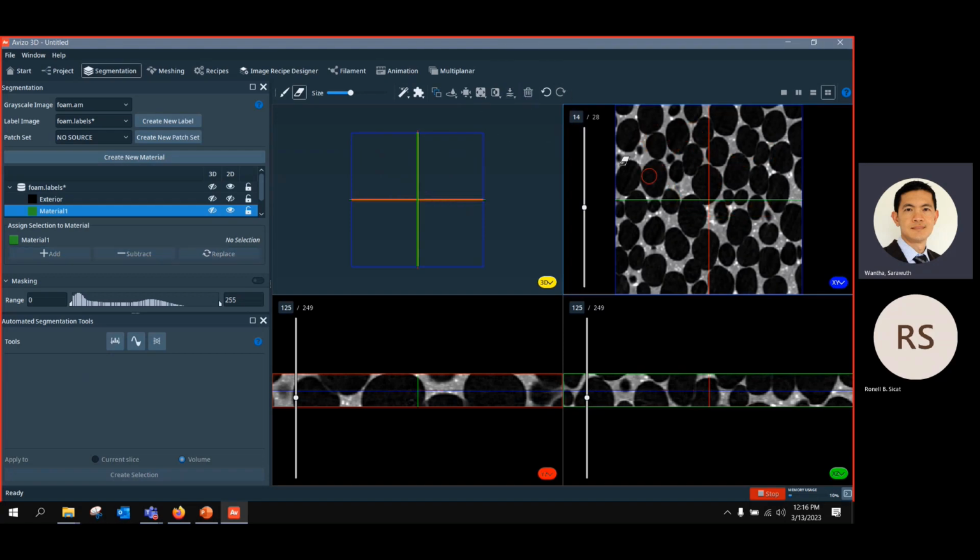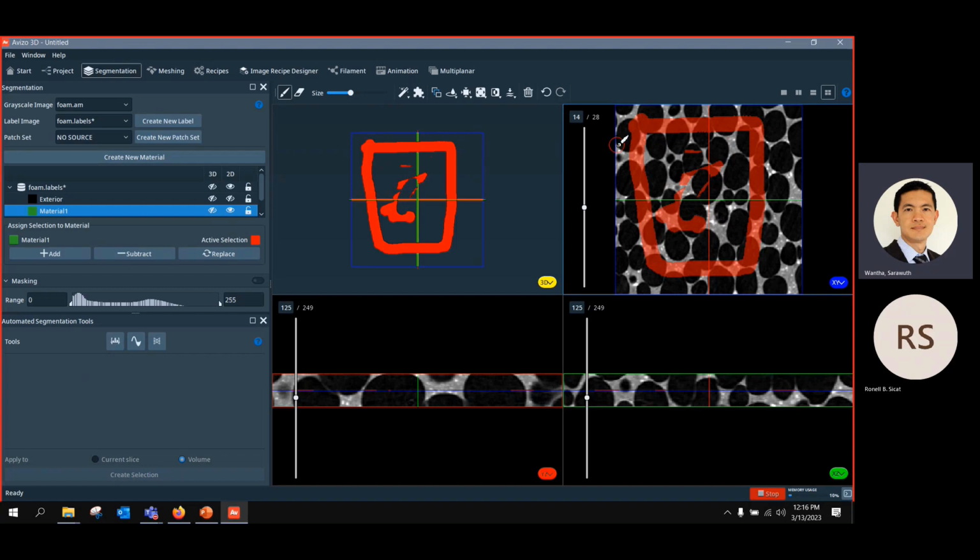So everything deletes. Okay, one more time. If you just paint like this, you can use the eraser to do this, or you can press Control as before, the same thing, Control, and erase. Or again, if I just paint like this and press F, it fills. Control to erase a bit like this.